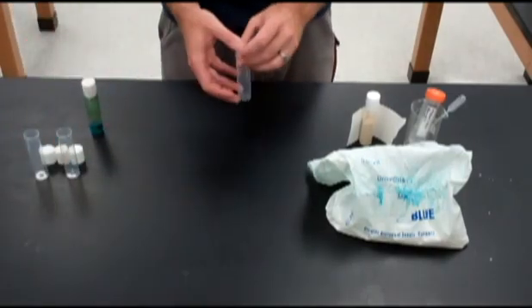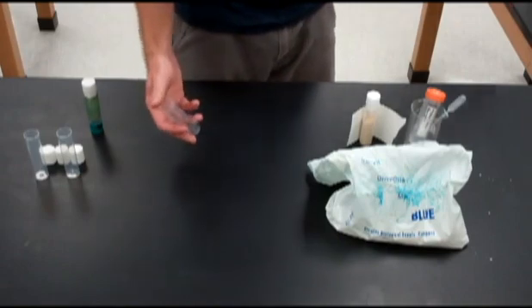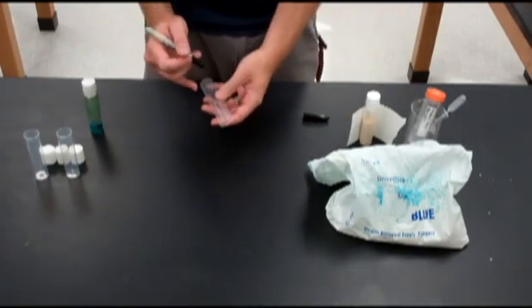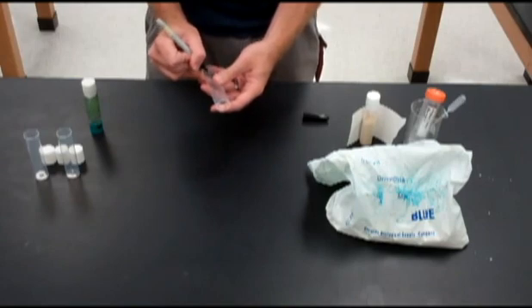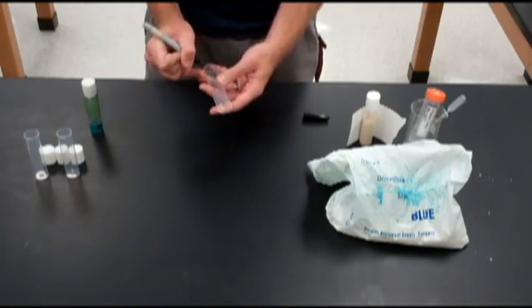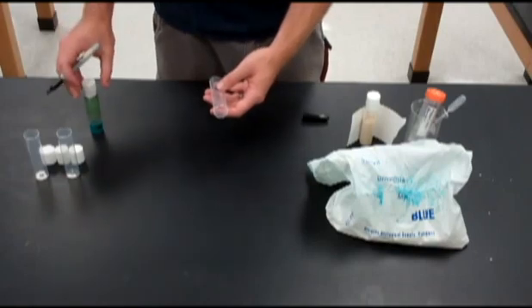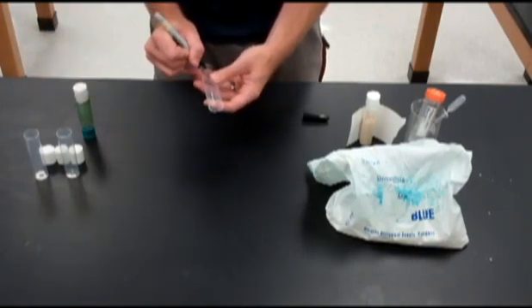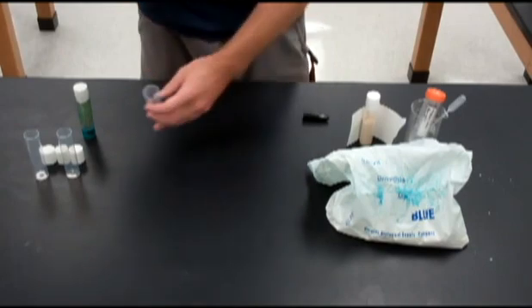The first thing we're going to need to do is label a tube. Grab a sharpie and we're going to add the date and the kind of fruit flies that are being recultured. So these are all wild type.